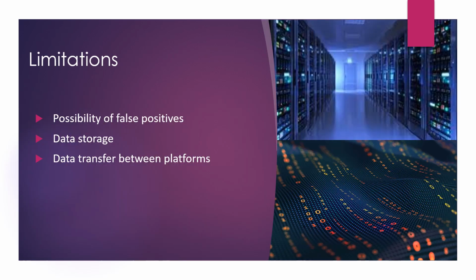Some limitations to this technique, which will probably be more obvious as time goes on, are the possibility of false positives, data storage limitations, and data transfer between platforms.